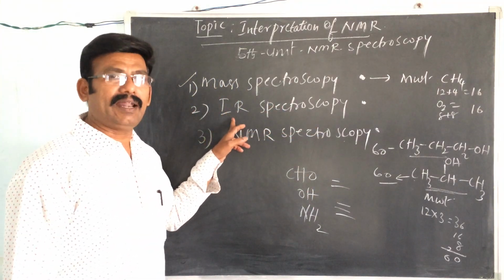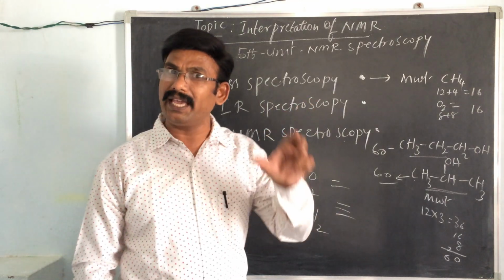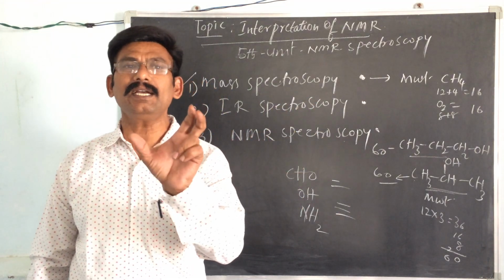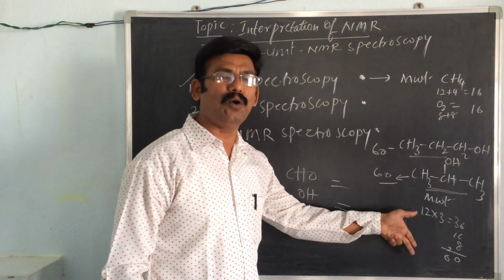Infrared spectroscopy gives only the functional group present in the compound.